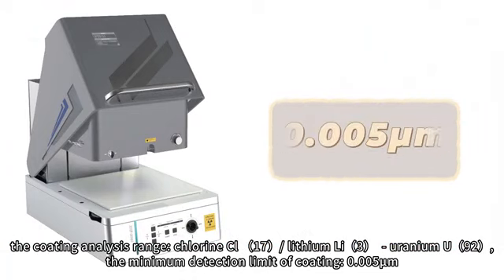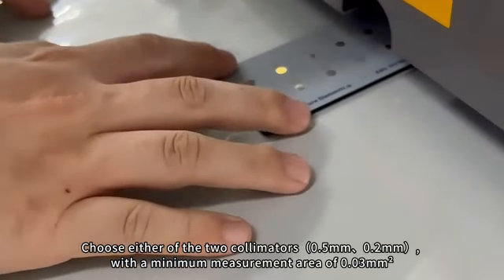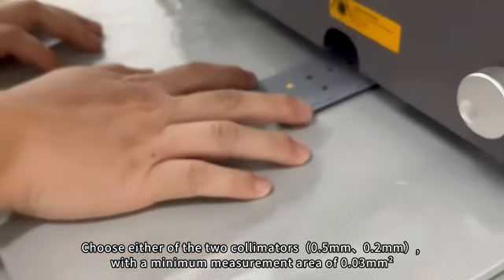The minimum detection limit of coating is 0.005 microns, with a minimum measurement area of 0.03 mm².